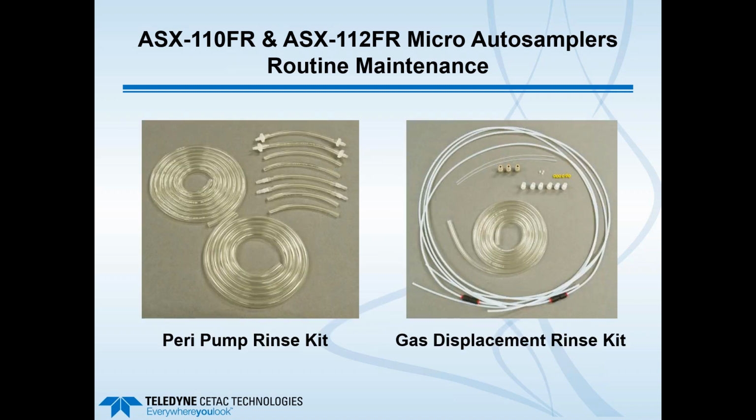And here are some pictures of some of the kits. There's an example peri-pump rinse kit, which contains, in this case, PVC peri-pump tubing, along with the transfer and the gravity drain tubing. And on the right, there is the full kit for the gas displacement rinse kit.